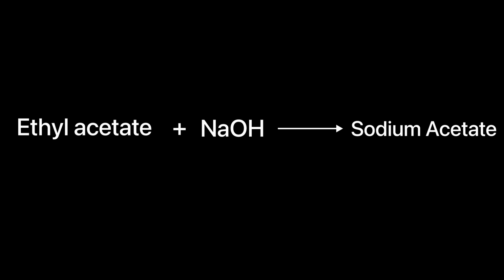CH3COOC2H5 plus NaOH gives rise to CH3COONa plus C2H5OH. The nature of the given reaction is a liquid phase reaction. It is second order because the rate depends on the concentration of both NaOH and CH3COOC2H5. As the objective of the experiment is to determine the rate constant K and to study the kinetics of the saponification reaction in a packed bed reactor, let's have a quick look at the reaction equation.